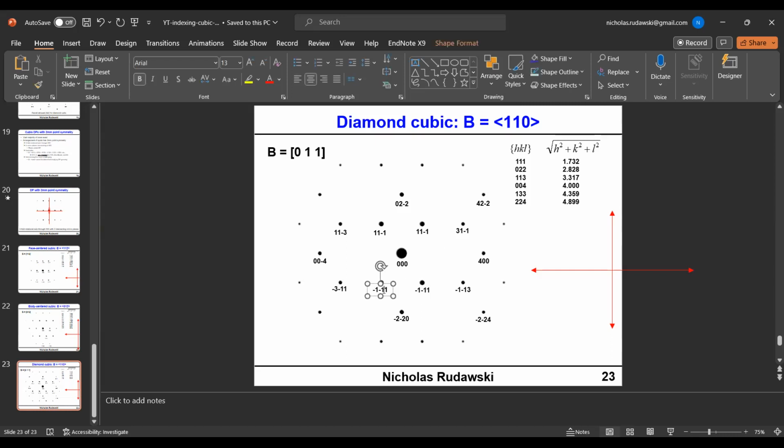So this is then the opposite there. This is the opposite there. Okay, and then this is 4 bar. Did I fix that one already?